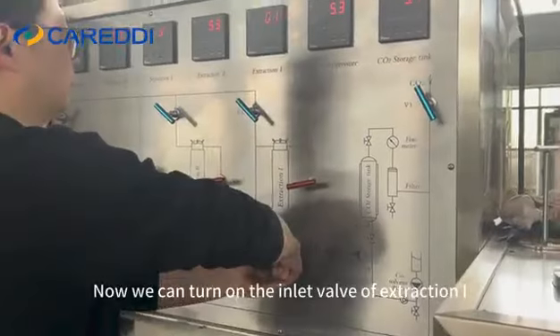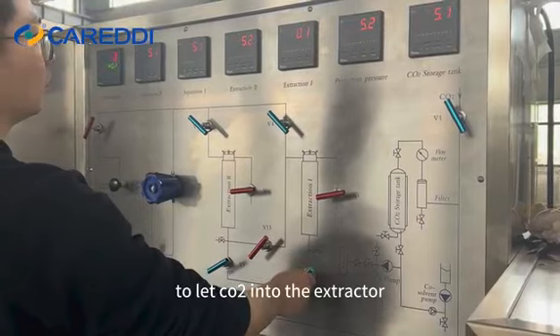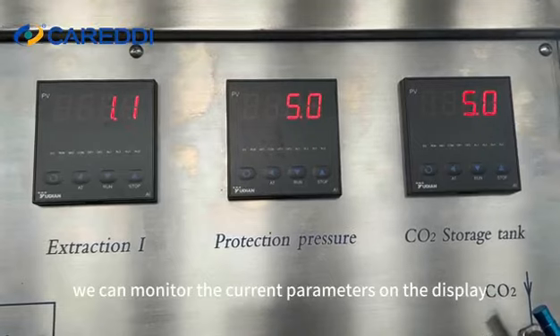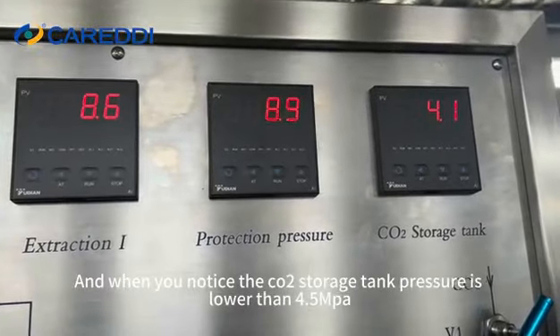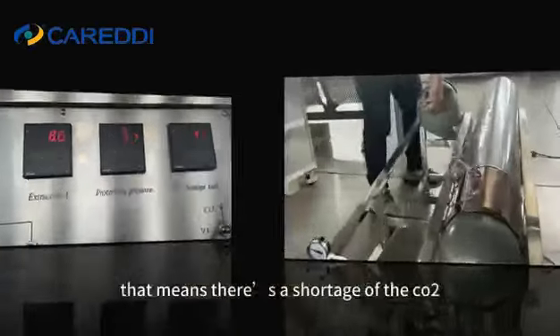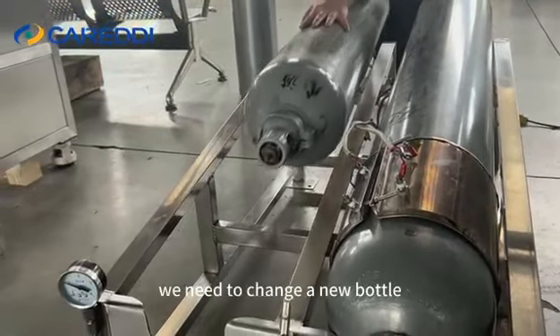Now we can turn on the inlet valve of extractor 1 to let CO2 into the extractor. The pressure will slowly rise up, and we can monitor the current parameters on the display. When you notice the CO2 storage tank pressure is lower than 4.5 MPa and the pressure won't go higher, that means there's a shortage of CO2 and we need to change to a new bottle.